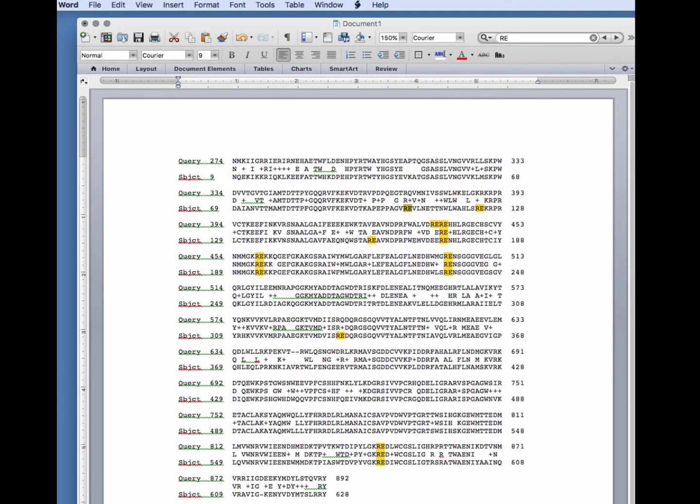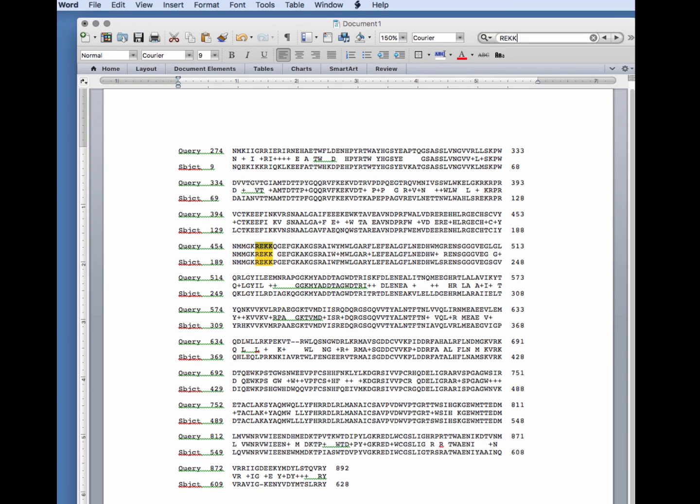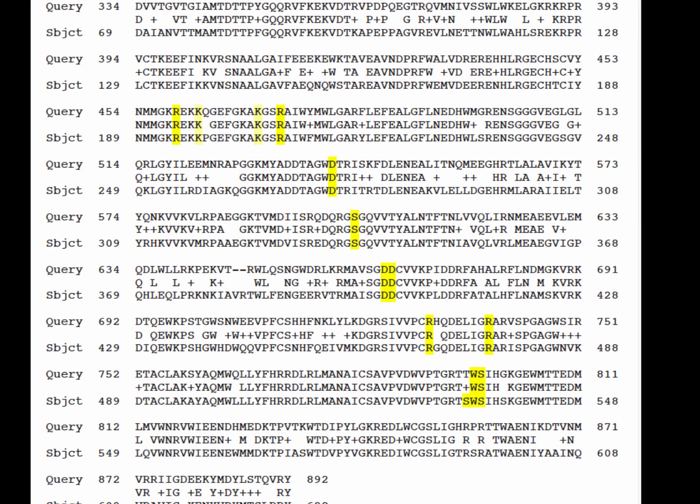When I've found one of my amino acids, I compare the sequences nearby to the sequence in the Molecule World Sequence Viewer to confirm that it's correct. If I can see that the amino acids that bind the molecule in my subject sequence are present in my Zika virus query, I can be pretty sure that the Zika virus protein is likely to bind to this same molecule.